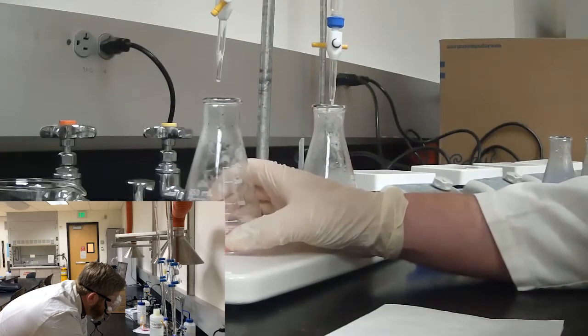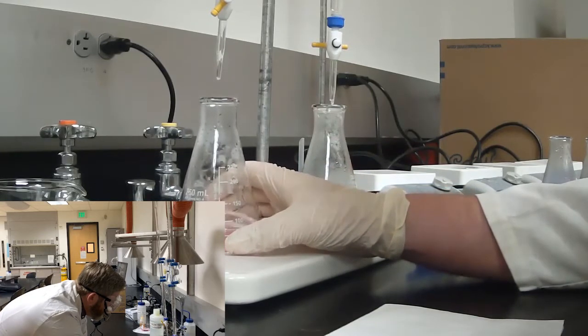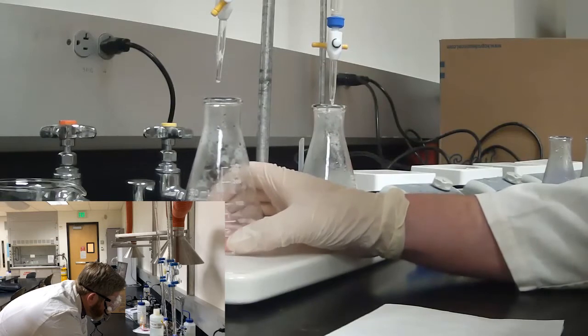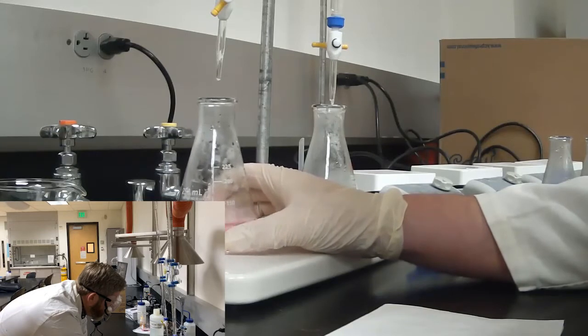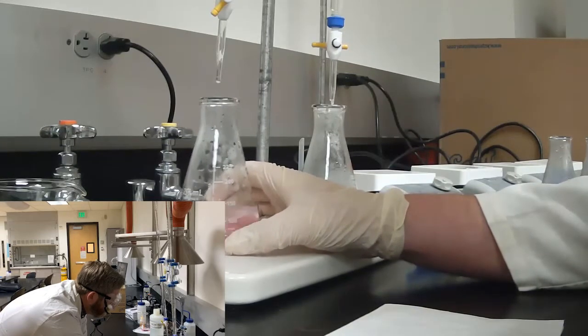Because the masses of these are both very close to each other, we should get the exact same volume, more or less, for our titrations. That will show whether or not our precision has been good, and you'll be required to comment on that in your lab report.